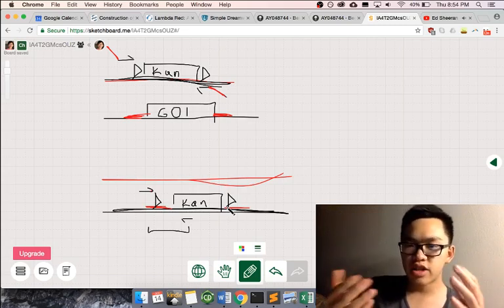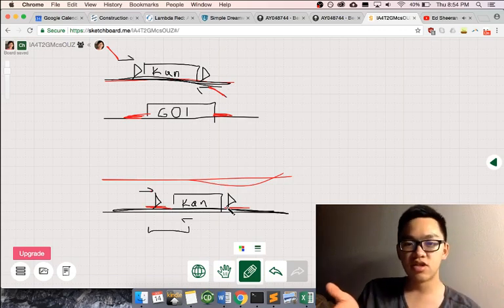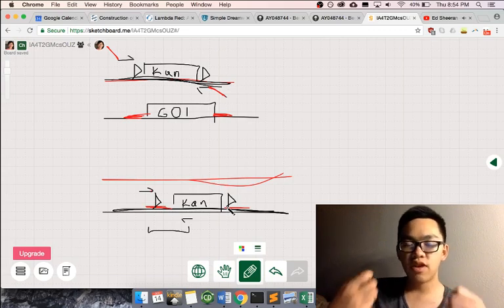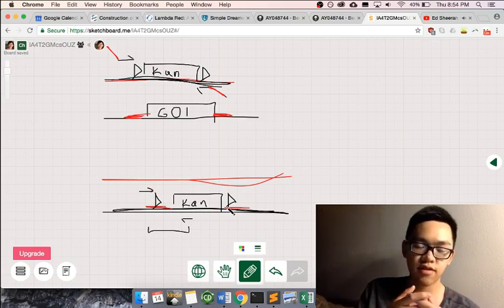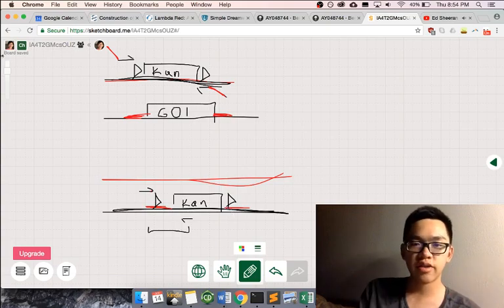And this is important because the kanamycin cassette might give a slight fitness defect to your strain, or you might want to use kanamycin as a selection marker for a later experiment. And so these FRT sites allow you to basically remove the CAN after you've integrated into the space of the genome where you have your single gene knockout.